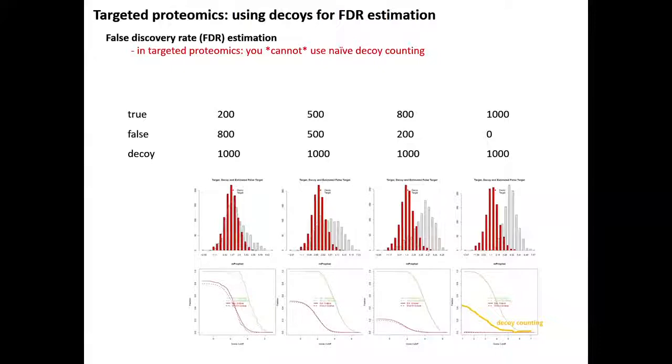But again, the point is that as long as you scale your decoys, whether they come from low or high, to the false targets, this is basically your correction for multiple testing. So the size of the database doesn't affect the decoys so much. It rather affects, as you will see from Isabel's talk, the ratio of false and true targets. This is actually the most concerning part.